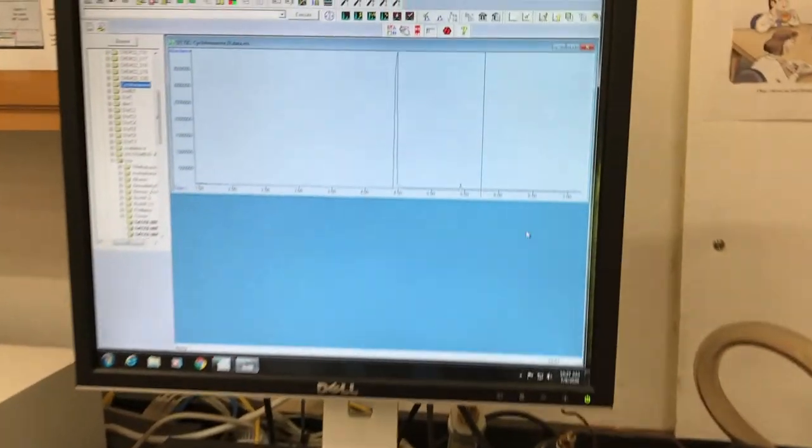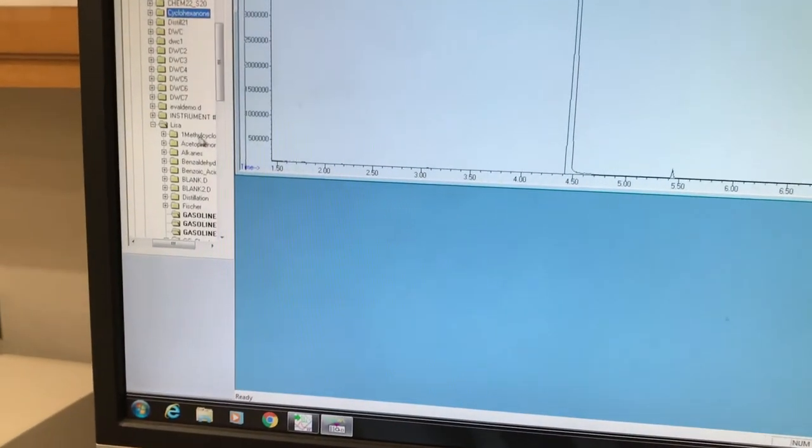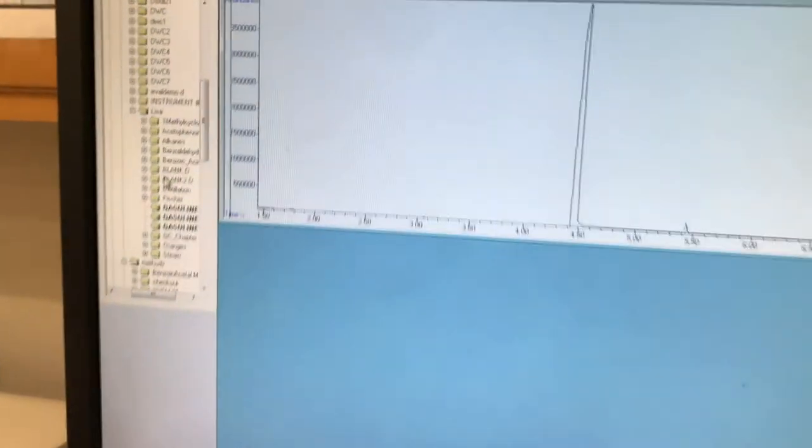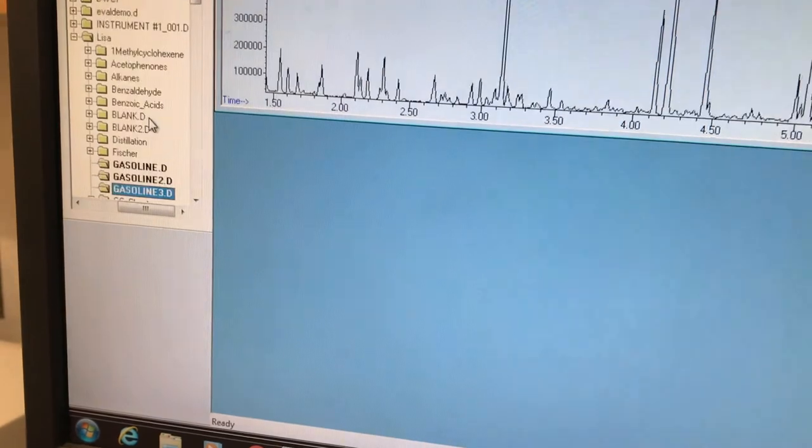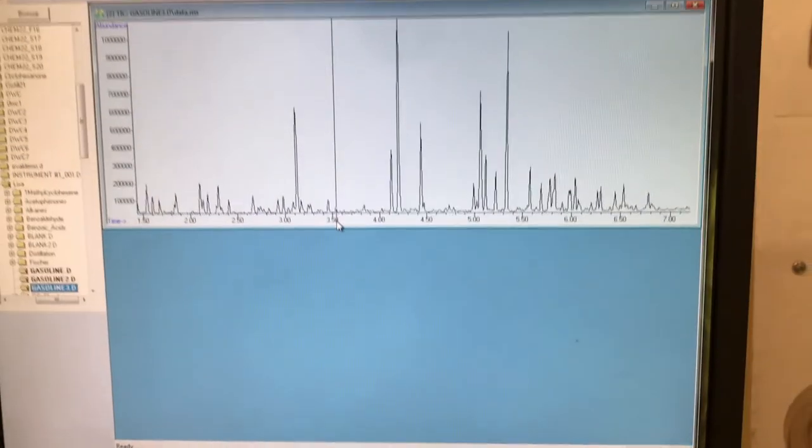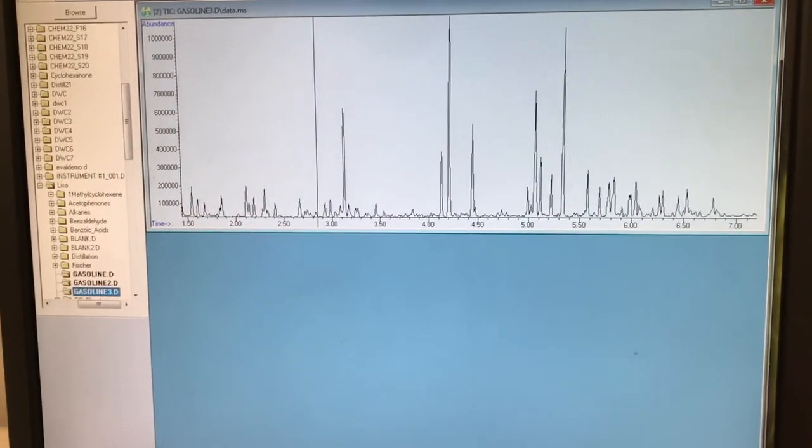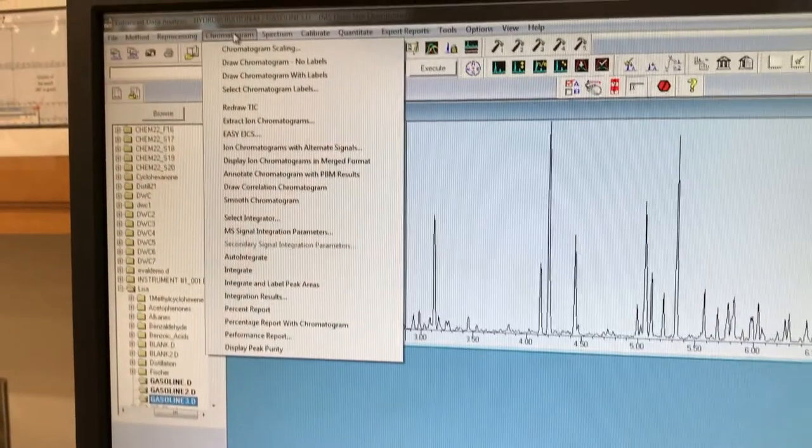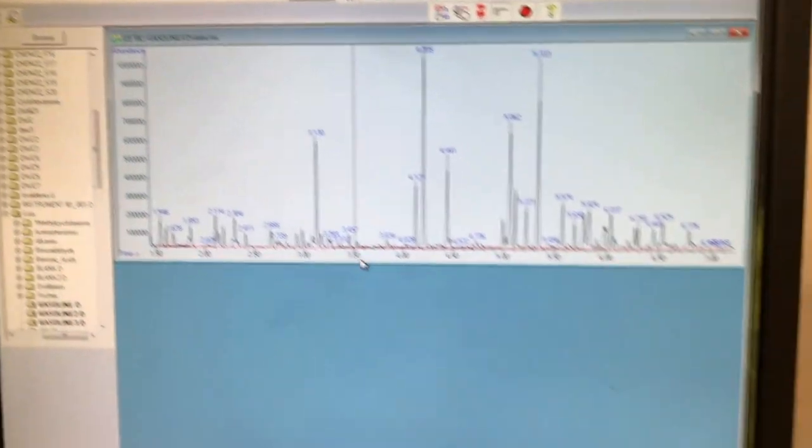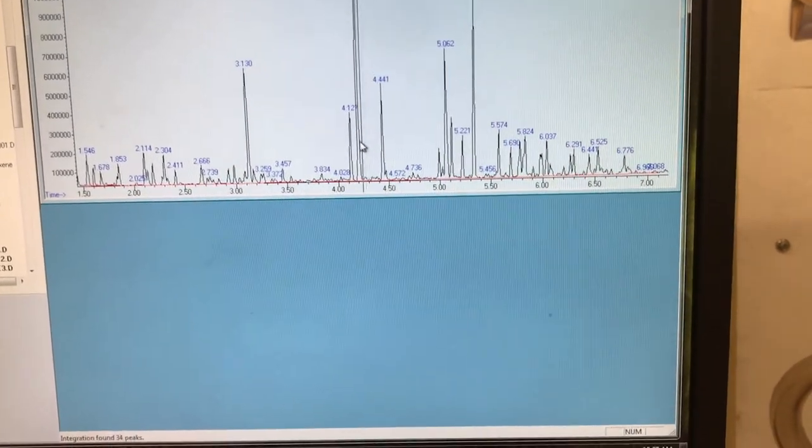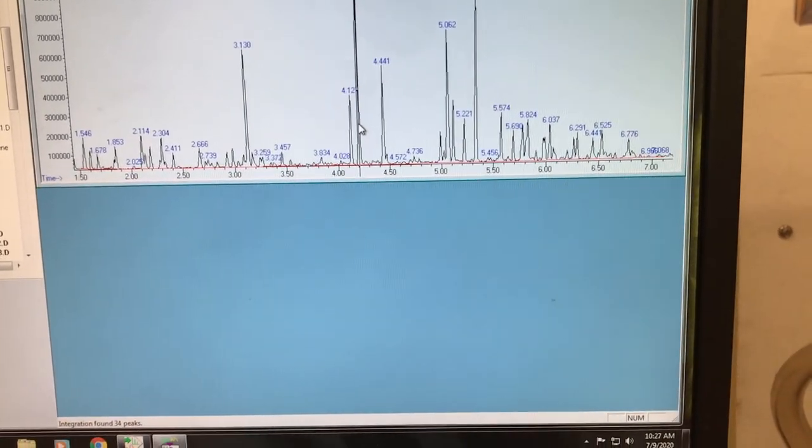So after it's run we then use a different program to analyze it. You find your file on the left and you double click on it. Here I run gasoline a couple times and here is my spectrum. The first thing that I'll do is choose chromatogram integrate and the computer will find the integral under each of the peaks so we can know how much is in each one. It also puts a number on there that marks the retention time.